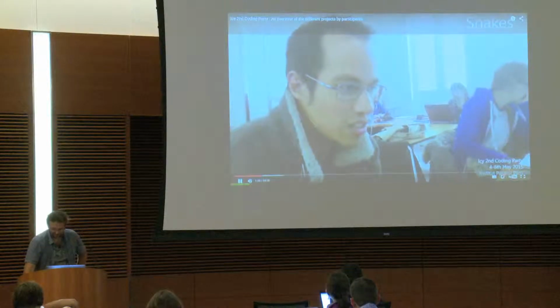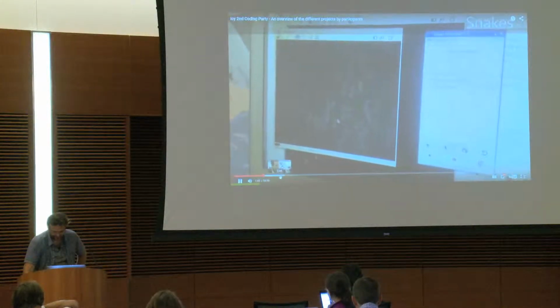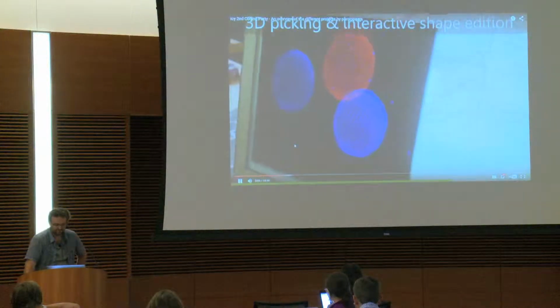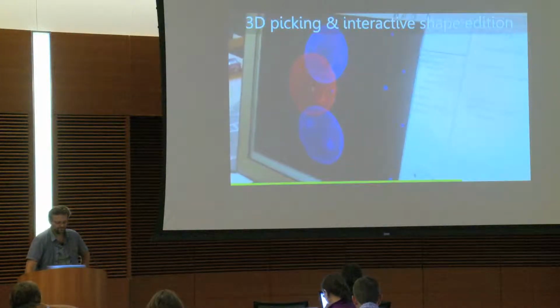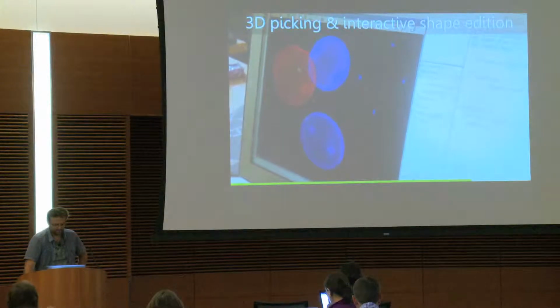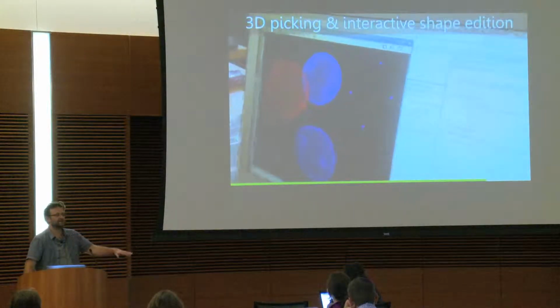I will switch a little bit to user interaction. So here we have an animation of a developer. Yeah, this guy is playing with 3D. It's actually very handy to make things faster, in terms of, for example, moving a snake to displace the snake. For example, if you go over a control point, you can drag it. So when he came to the coding party, he said, okay, Blender is like that, I like the same.